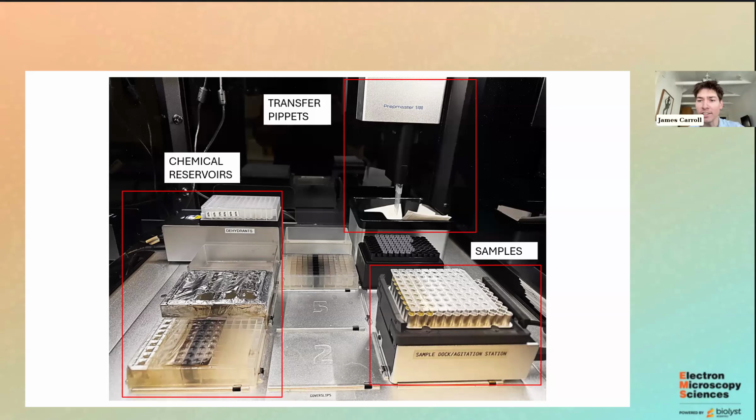we had a question about heating certain chemicals. If it's part of a protocol, can you set up your chemical in the reservoir and do some heating? Or cooling? Yeah. For instance, when we were doing the resin in here, we'll put them on at 40 degrees. I don't recall how hot the agitation station goes. This would probably be a question for Tom. But then also where the dehydrants is, I know we can set that to a certain temperature as well. So there is temperature control in these. It goes up to 100. We rarely go above 70.